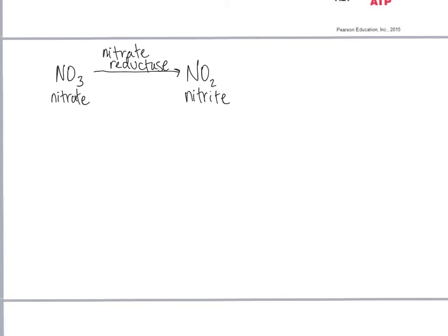Nitrite. Okay, so that's what the enzyme does. And you're going to be inoculating a broth, again with your loop, a broth that has some potassium nitrate in it, the source of nitrate ions. So you're just going to inoculate that and incubate it. When you come in, we want to test to see if this product, nitrite, is there.